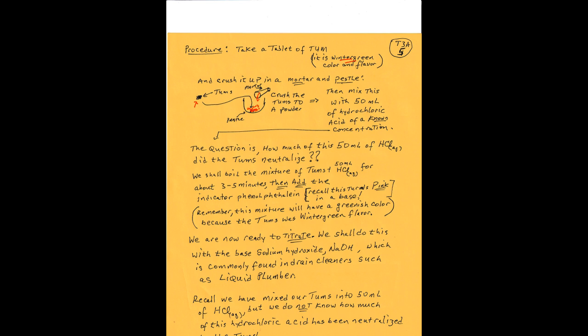And then we're going to mix this in with 50 milliliters of hydrochloric acid. And we know the concentration. We'll talk about concentration later, not in this lecture. So we're going to mix the Tums with 50 milliliters of hydrochloric acid. Now, the question is, how much of these 50 milliliters of hydrochloric acid did the Tums neutralize? We don't know. So that's what we want to try to figure out.